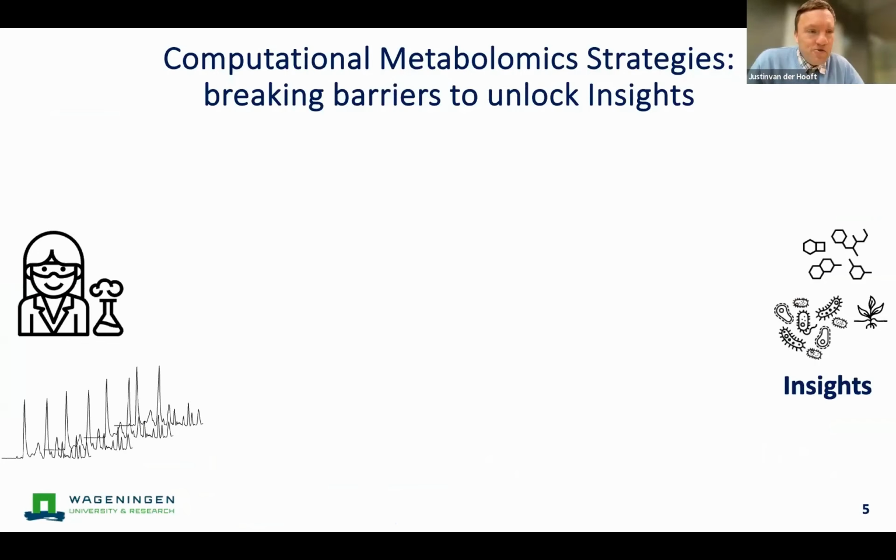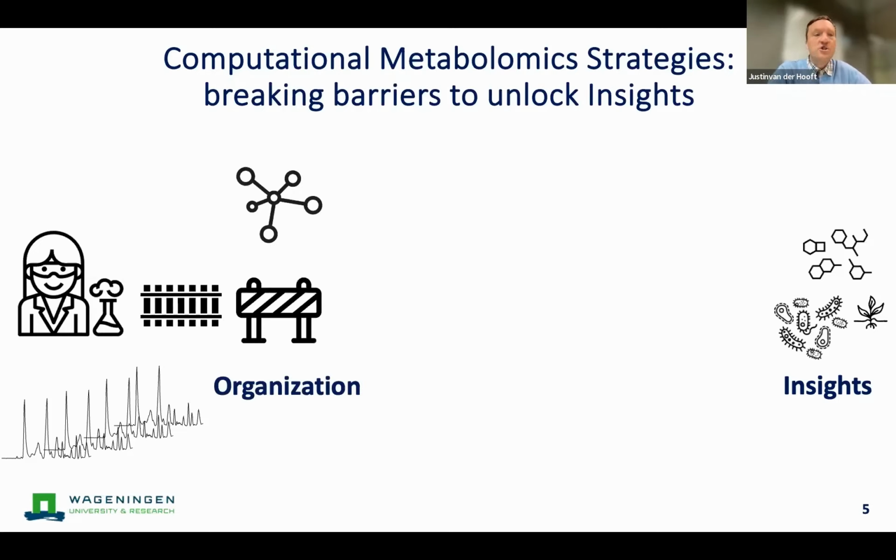So we can discuss a lot about the various aspects of metabolomics workflows, and with my team, we do not cover everything. That will be too much. So I highlight here the key areas that we work on in this slide to get you an idea of where we are in that pipeline when I talk about the prioritization tools. So when we consider a researcher and her data, then one of the first roadblocks to overcome is how to organize the ever-increasing amounts of data, not only from the experiment, but also all the public data, and how to create the links that are needed to get to the insights.